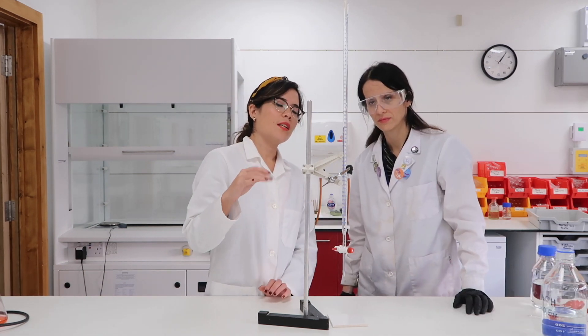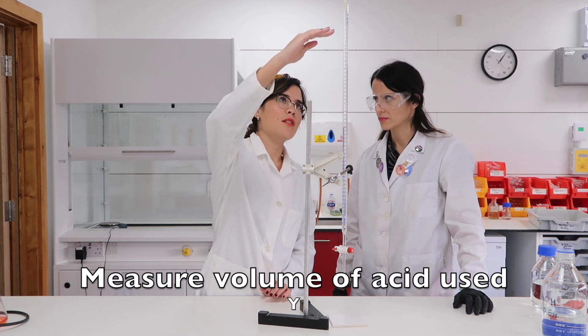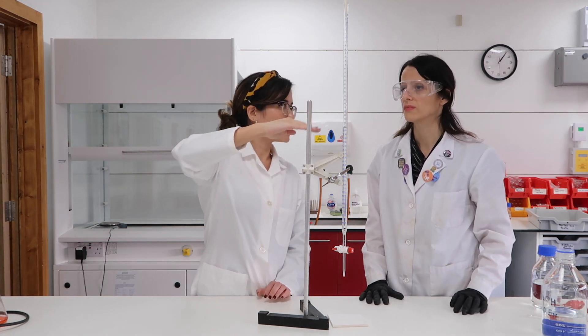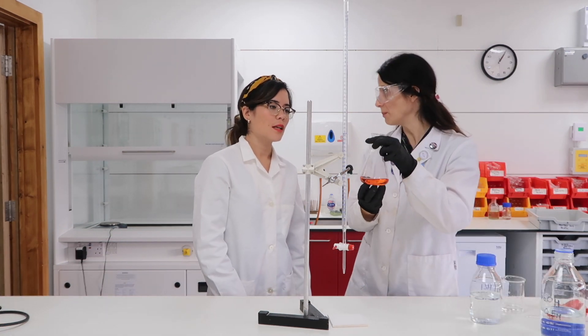The essential thing now is that we read the volume of acid that was added. Notice that the burette runs from zero centimeters cubed down to 50, so we're trying to work out this volume. Reading from the bottom of the meniscus, we can see that 25 centimeters cubed of acid was added. If you have a darker color, it means you have gone further than the endpoint.